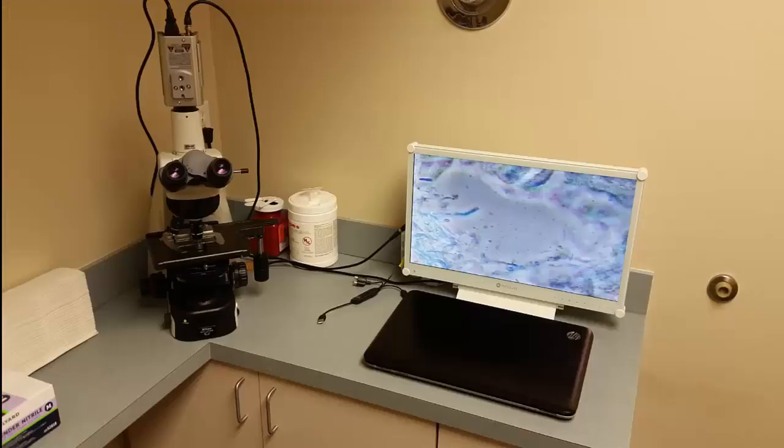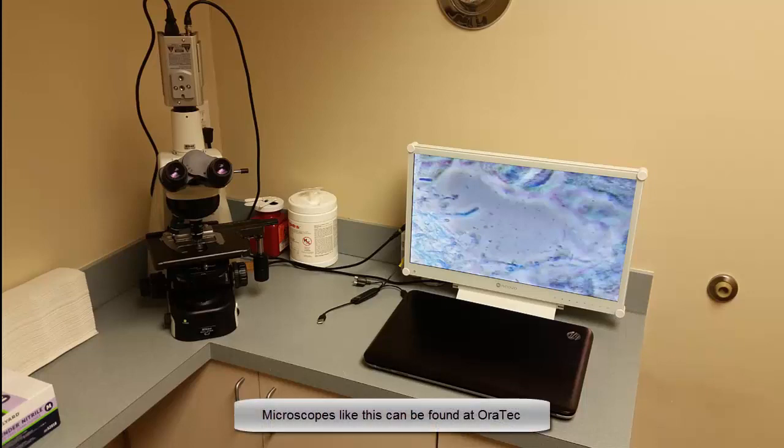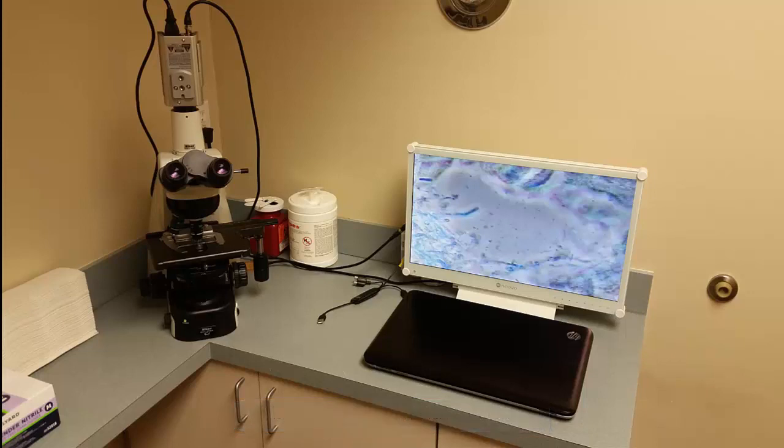What we have here is my new toy. It is a Nikon research grade phase contrast microscope. It's got two turrets and it's possible to look at 400 times and 1,000 times power. There's a camera mounted on the top with a flat screen digital display so patients can see exactly what I see, and we use this technology to diagnose risk assessment with the biofilm a patient has in their mouth.